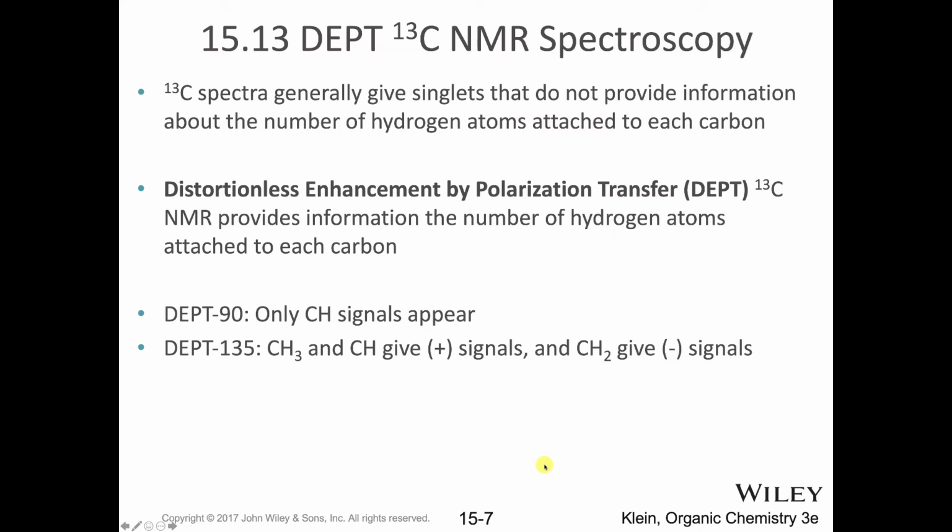Now, I will give you at least a little brief idea about what happens. This is a technique that is able to use a series of radio pulses in a certain arrangement, and also polarization, which just means in three-dimensional space, the radio wave is kind of rotated at the plane of that wave in how it's oscillating in space relative to the other radio signals.